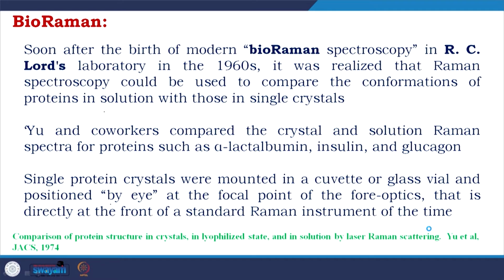Yu and co-workers compared the crystal and solution Raman spectra for proteins such as alpha lactalbumin, insulin and glucagon. So, they take it in solution, they take it in the crystal, and they compare. Single protein crystals were mounted in a cuvette or glass vial and positioned by eye at the focal point of the fore optics, directly at the front of a standard Raman instrument of the time.